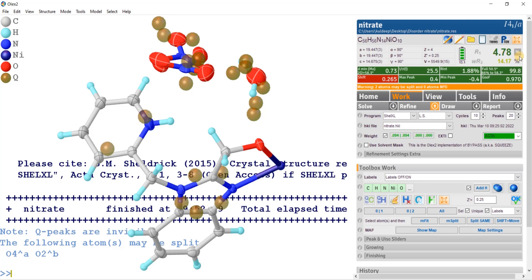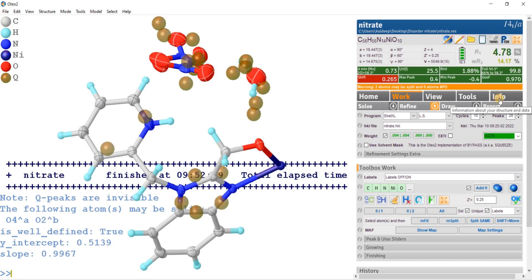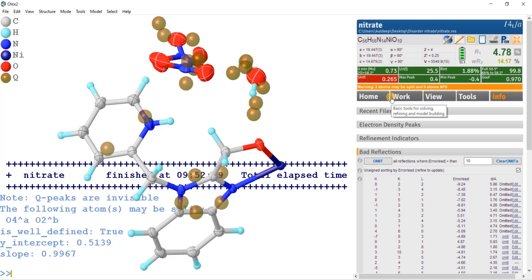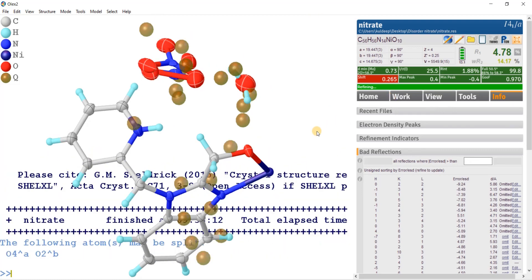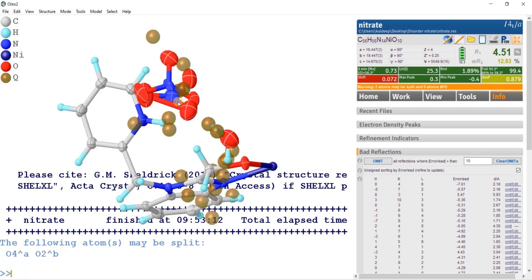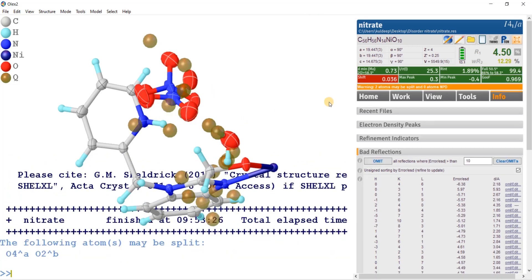The R factor is 4.78%. Some reflections are getting off. Going to INFO > bad reflections: I will delete the reflections with ESD more than five. Omitting them and refining once again. The R factor has improved. I have also deleted the extra bond with DEL BOND and refined with Control R. Now the statistics are much better and improved.